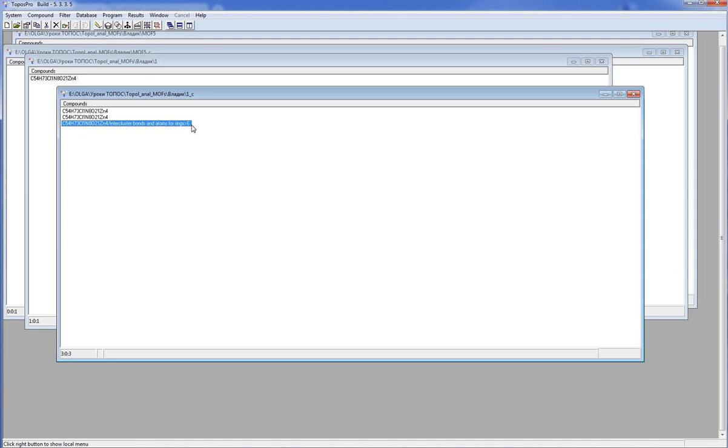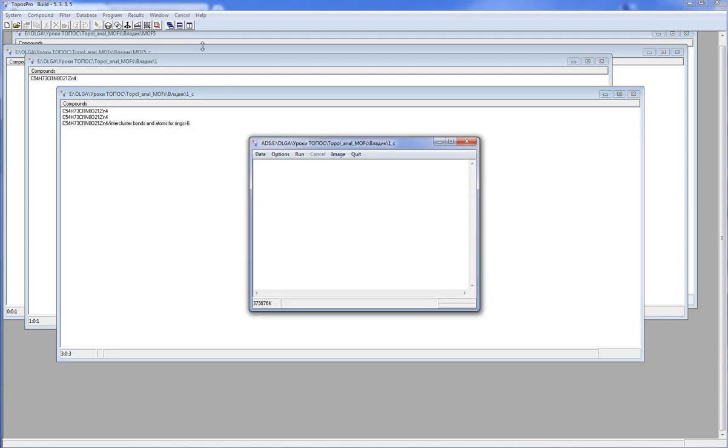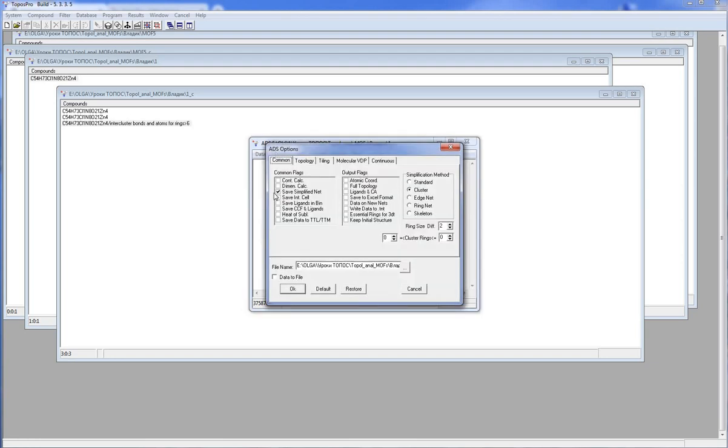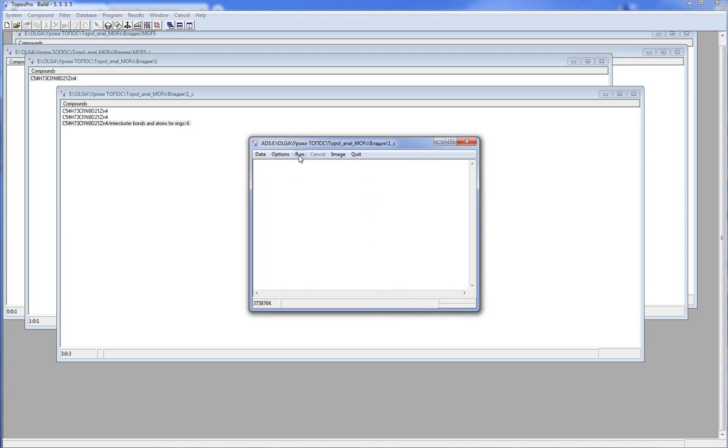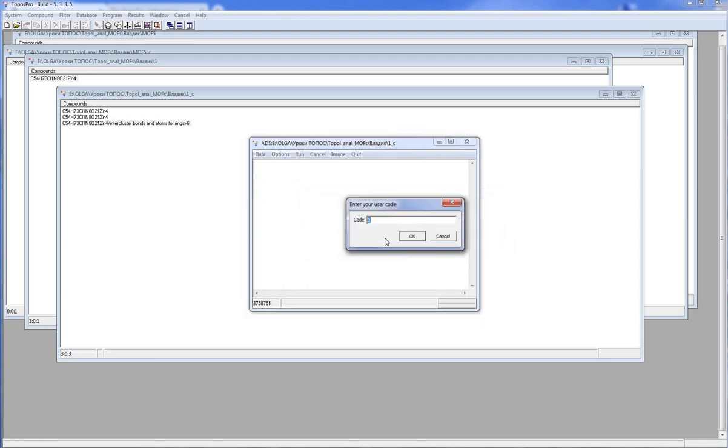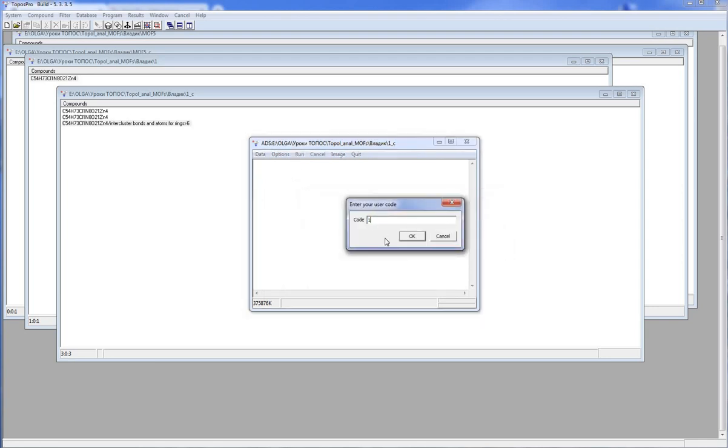Now we should perform the standard simplification for the molecular structure, where the structural units are connected by the pseudohydrogen bonds. If you do not know how to do it in detail, see our lesson, the standard simplification method. So, I run the ADS options, save simplified net, standard method. Tab Topology specifies that valence bonds connect atoms and hydrogen bonds connect molecular structural units. Then I press Run. In the window Central Atoms, press Whole Molecule.